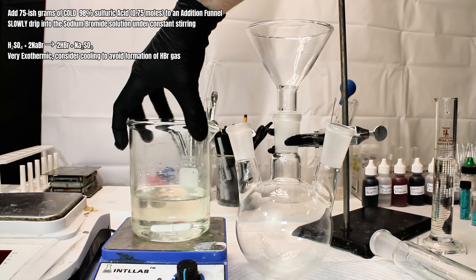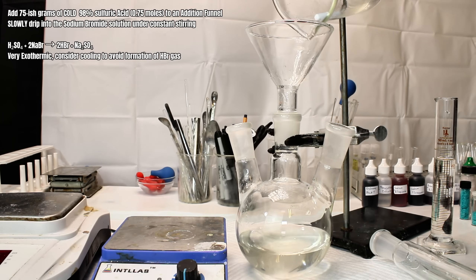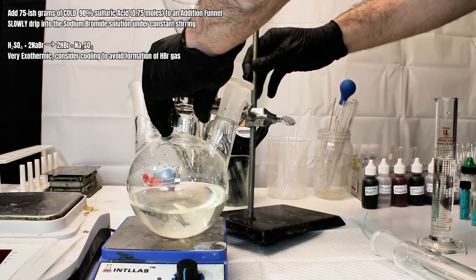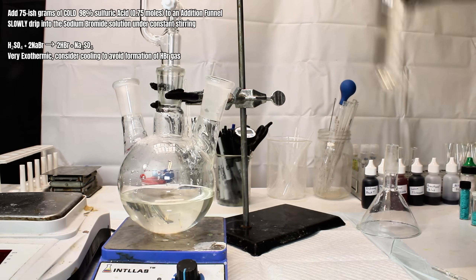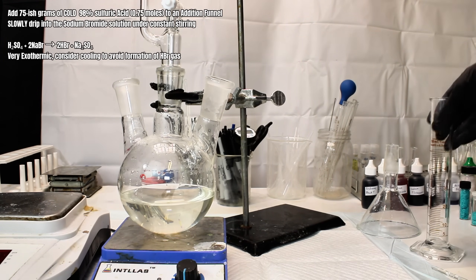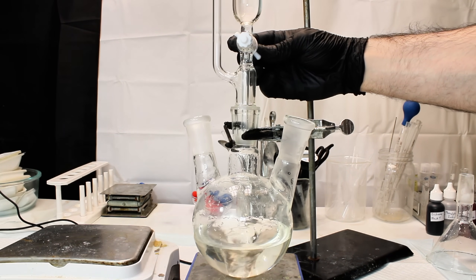The addition funnel is filled with 75 grams, or around 0.75 moles, of 98% sulfuric acid, which is slowly dripped into the sodium bromide solution under constant stirring. This reaction might require external cooling, as it's very exothermic, and actually produces hydrobromic acid in solution. Hydrobromic acid itself usually exists in a slight equilibrium with bromine, which will discolor the solution a pale yellow color as more hydrobromic acid is produced.